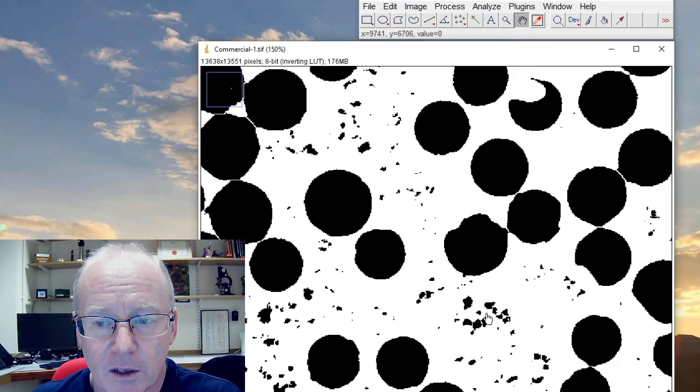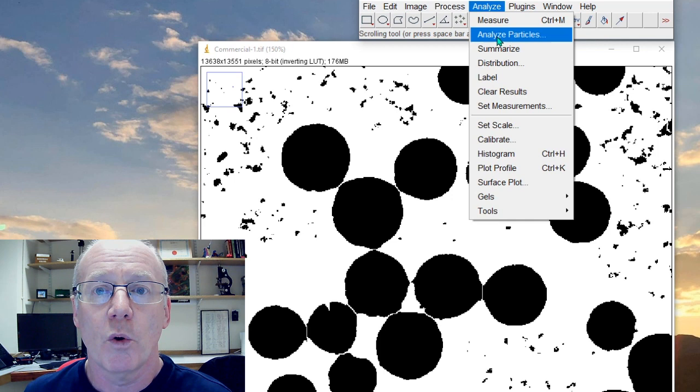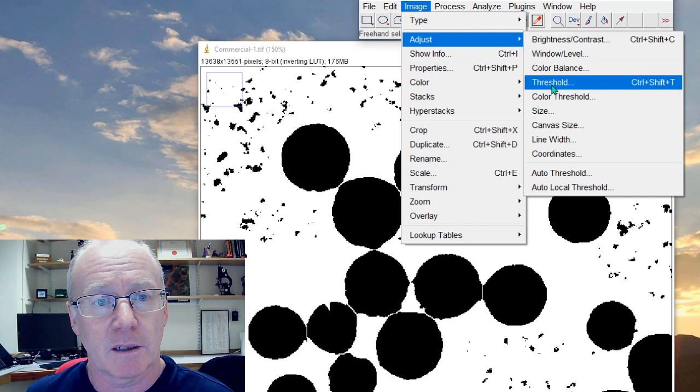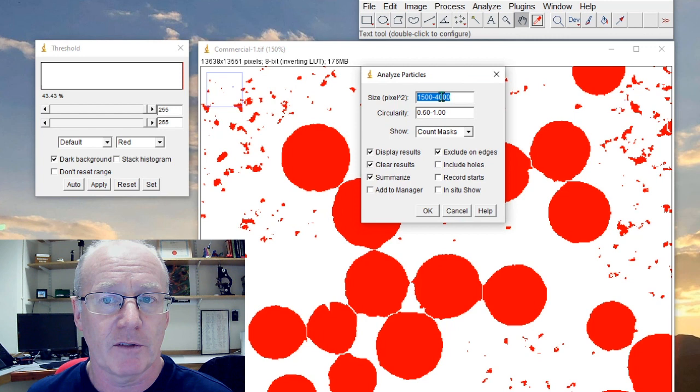Okay so we've got nice separate objects. What we want to do now is to pull those out using Analyze Particles. But the analyze particles will only work on a thresholded object, so we'll bring the threshold back in and we'll do Analyze Particles. Now I've set this already to be between 1500 and 4000 pixels—so this is the size range in which I want to collect data. Anything that falls outside that size range is excluded.